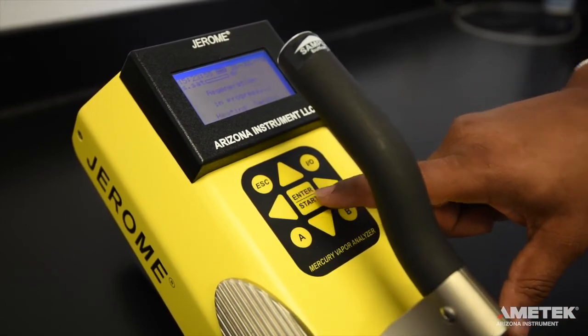Regeneration will then begin. A regeneration cycle takes approximately 45 minutes, during which time you will not be able to use the instrument. Do not interrupt the cycle. If any error messages appear, refer to the troubleshooting section of the manual, or contact Ametek Arizona Instrument or your local representative for assistance.